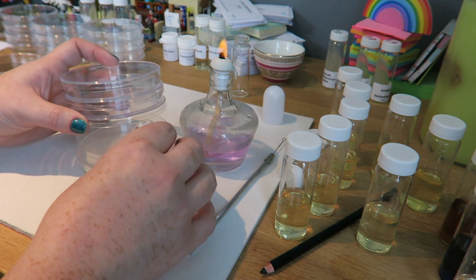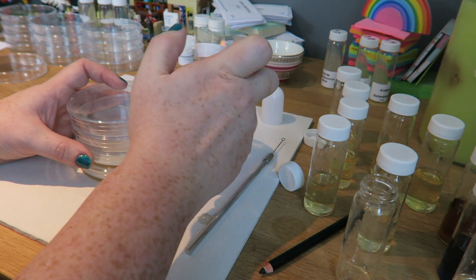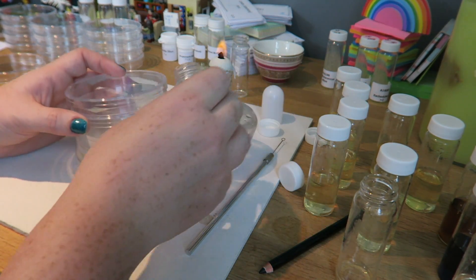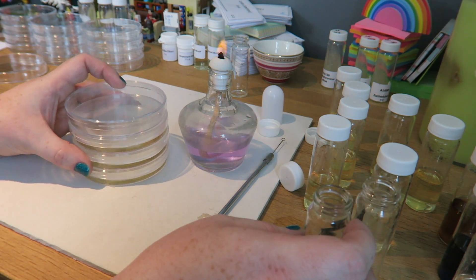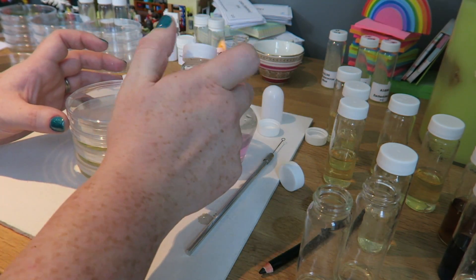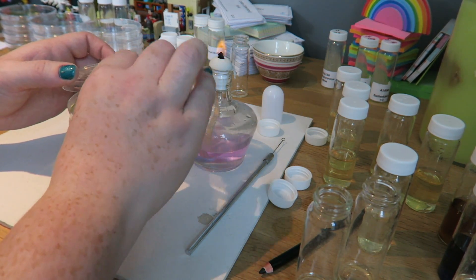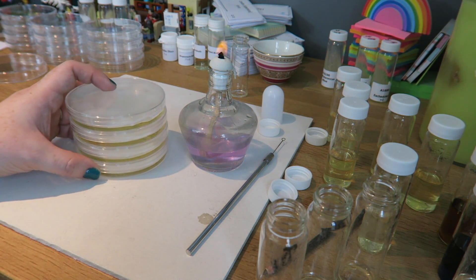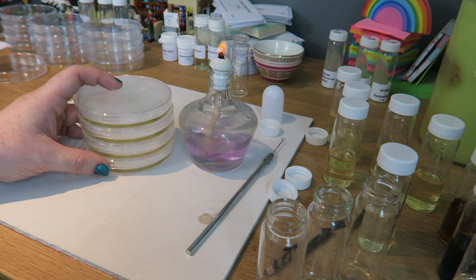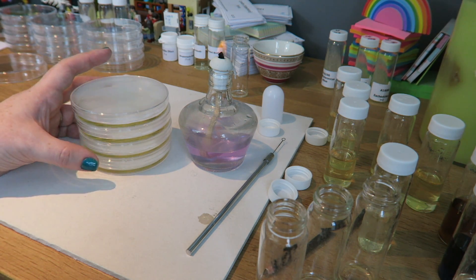Lid off, discard it, flame it, pour. Lid off, discard it, flame it, pour. You can just give them a little swirl at the end to make sure that the agar is everywhere on the plate.